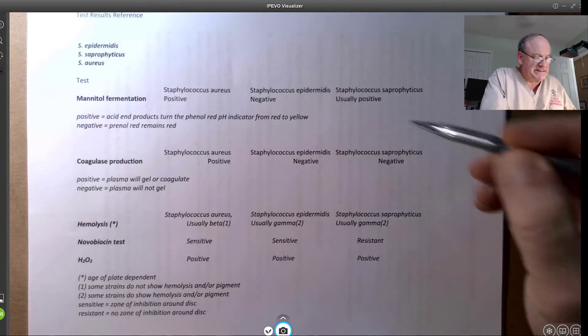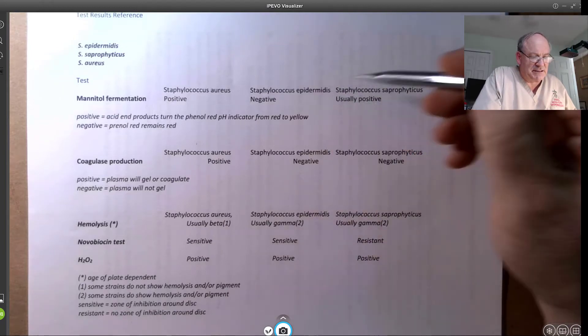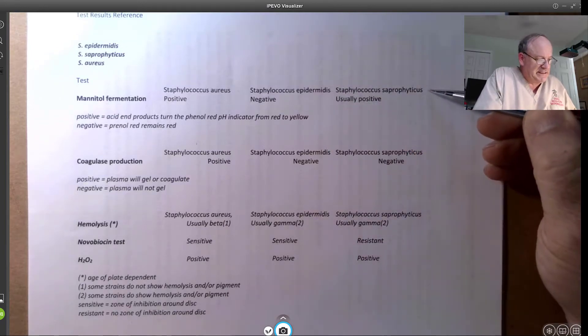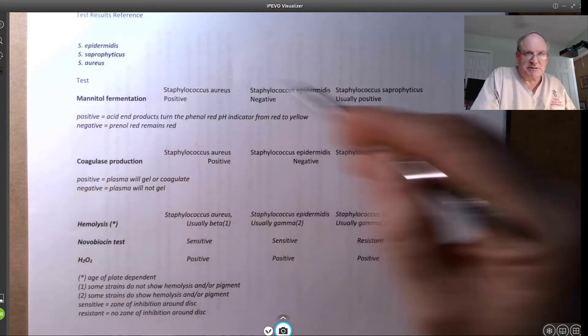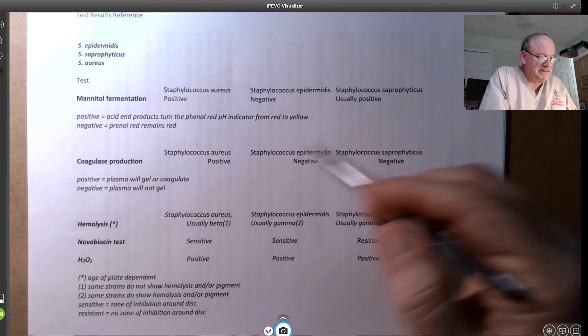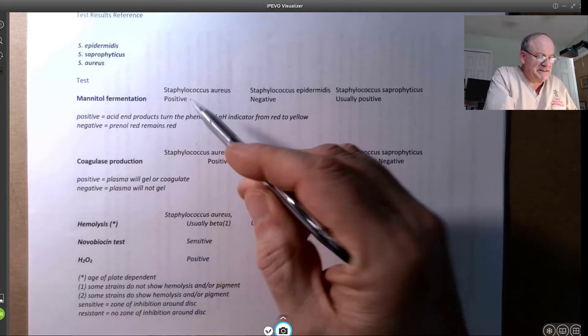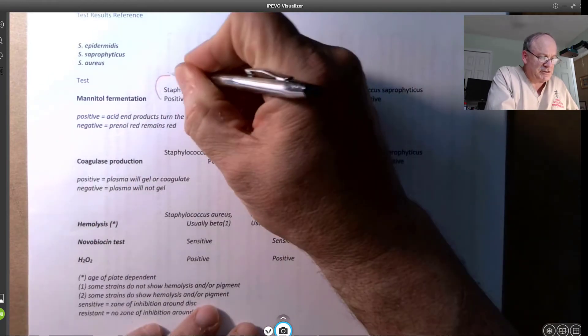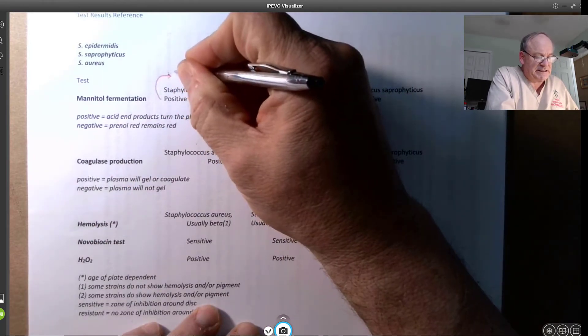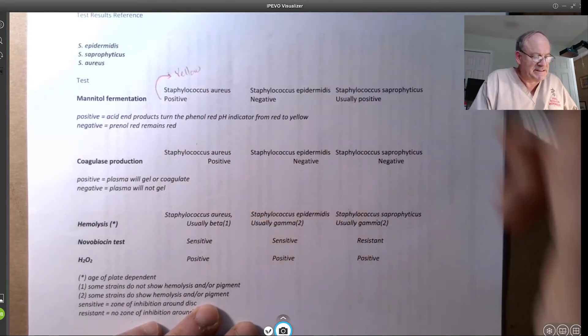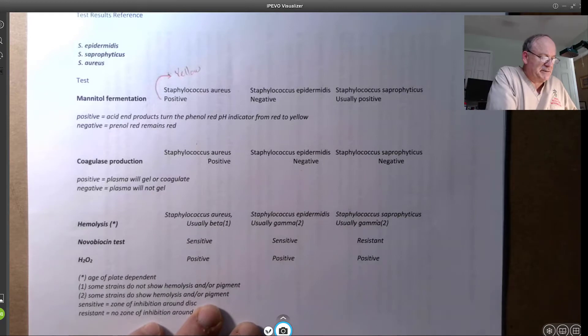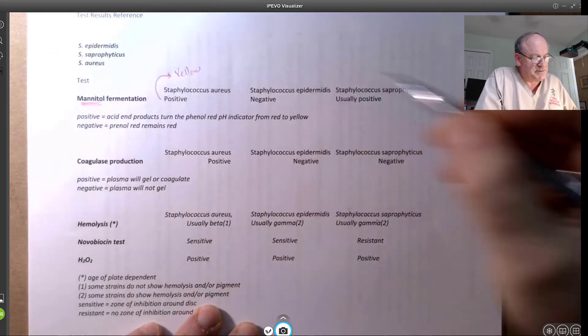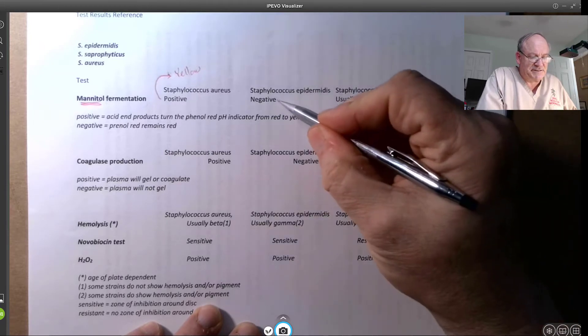So we're looking at Staph aureus, Staph epidermidis, and Staphylococcus saprophyticus. And if you look at the mannitol types of plates that you see there, it's positive for mannitol. It means that it produces an acid, and it will turn the media yellow for the presence of an acid, indicating fermentation occurred based on the mannitol fermentation.